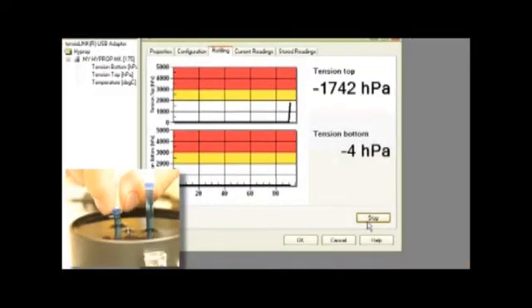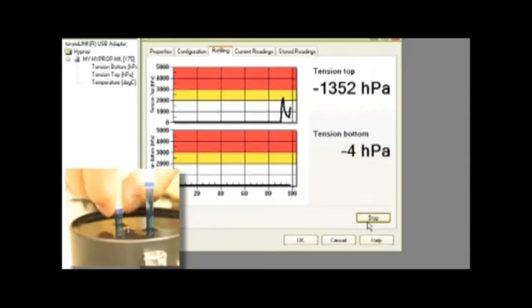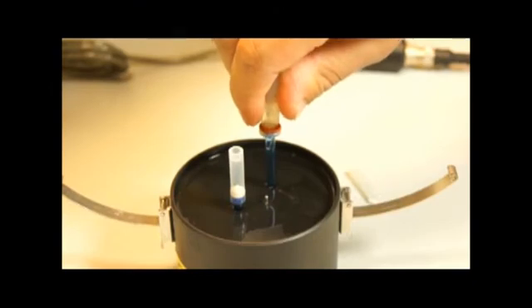Slowly and smoothly start screwing the tensiometer into the port. Once the rubber gasket touches the base, slow down and watch the screen to make sure the pressure stays under 2000 hectopascals. Now cap the tensiometers to keep them from drying out.